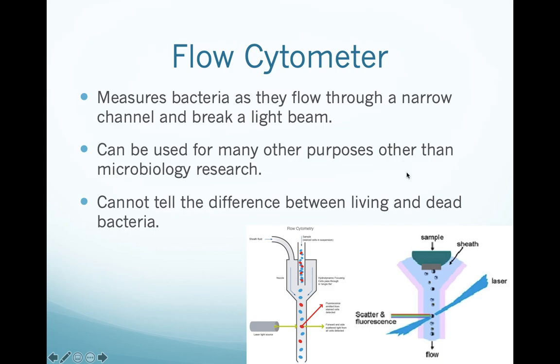Now this is pretty cool. Essentially, you have a little water bath up at the top, and a little flow of water that's going to flow around it. You put your sample up at the top in the little well. You guys can see this up here. Essentially, the sample is going to be released very slowly, one single bacteria at a time, down through a little tube that has a laser beam that runs through it.